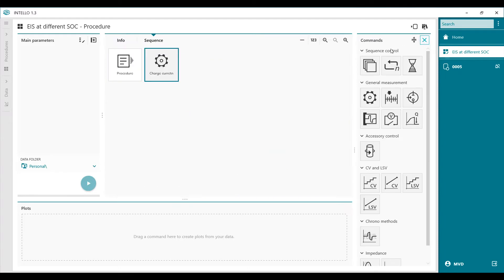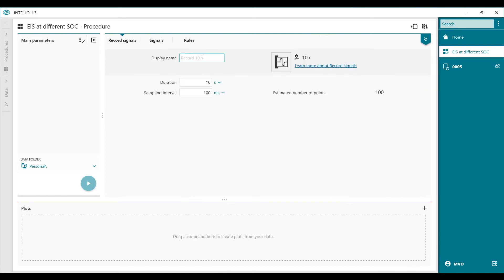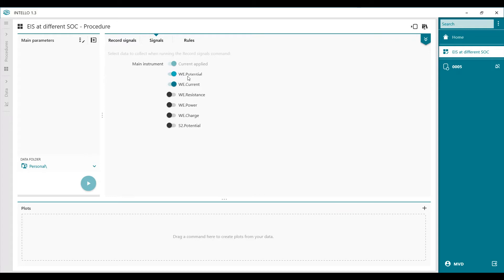Then we go to record the signal. We're recording the potential back — we apply a current and measure the potential back — and that's done in the Record Signals command. We give it a name as well: charge time for 60 seconds with an interval time of 100 milliseconds. We measure the potential, and you can also measure the current, but this is what we apply.